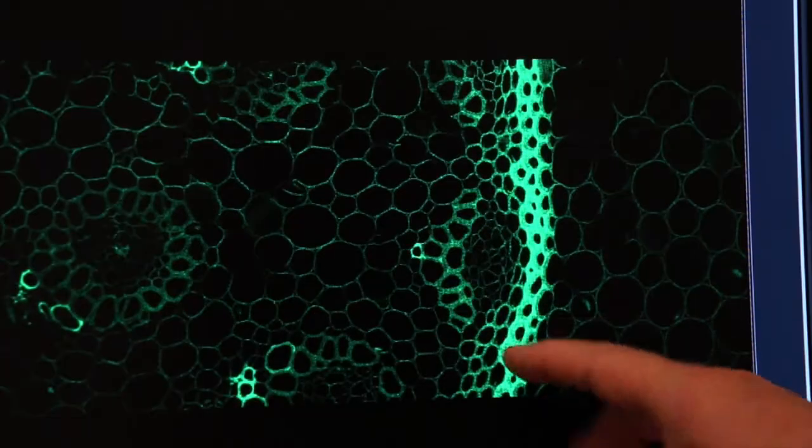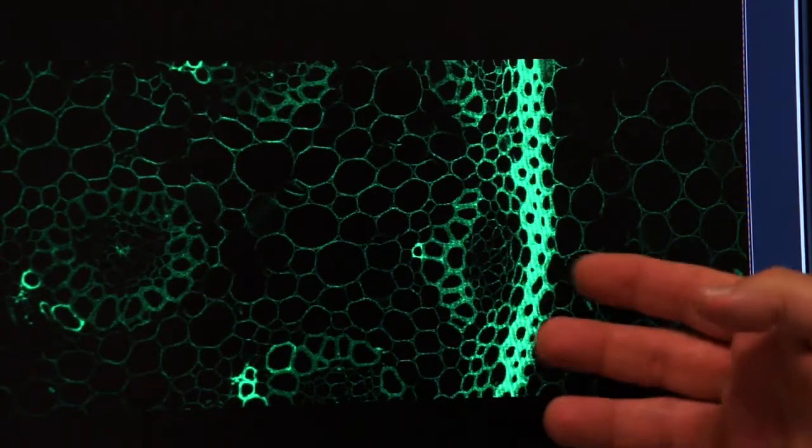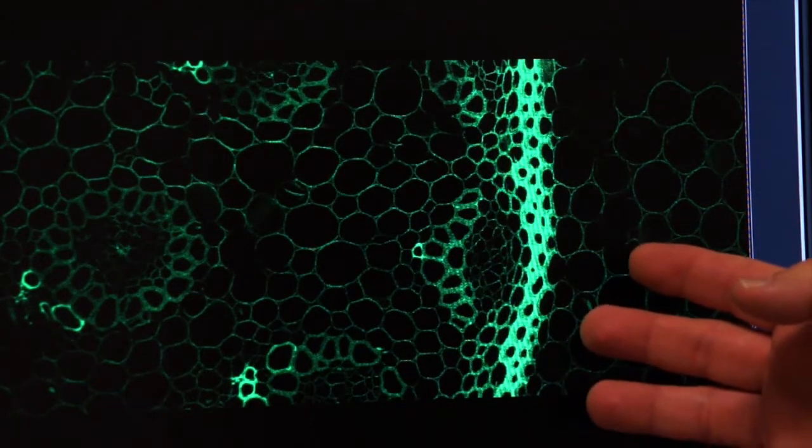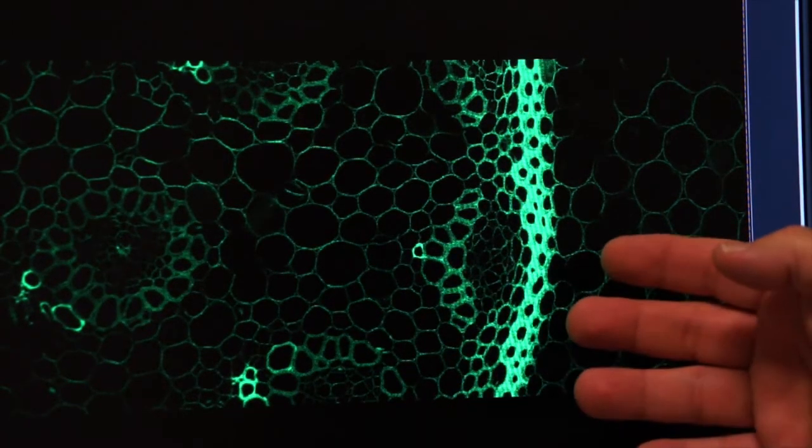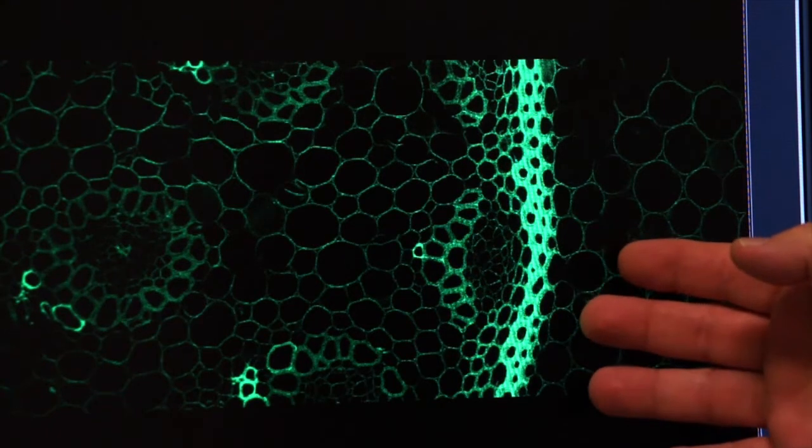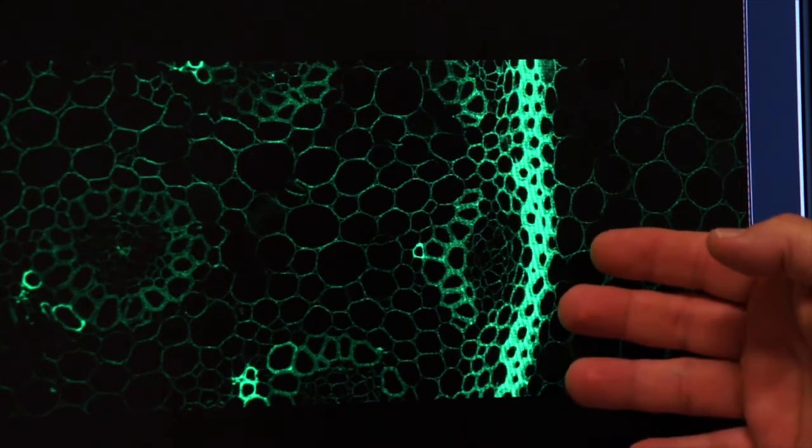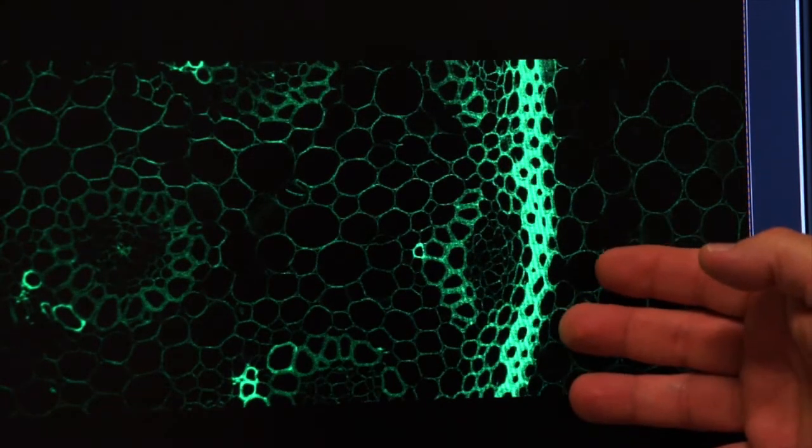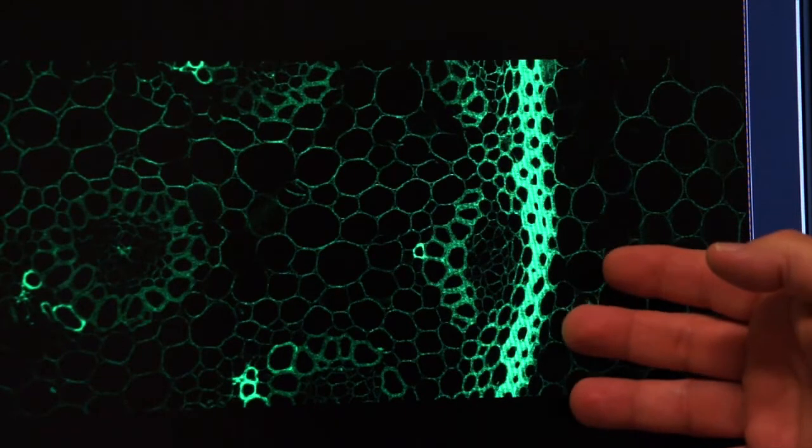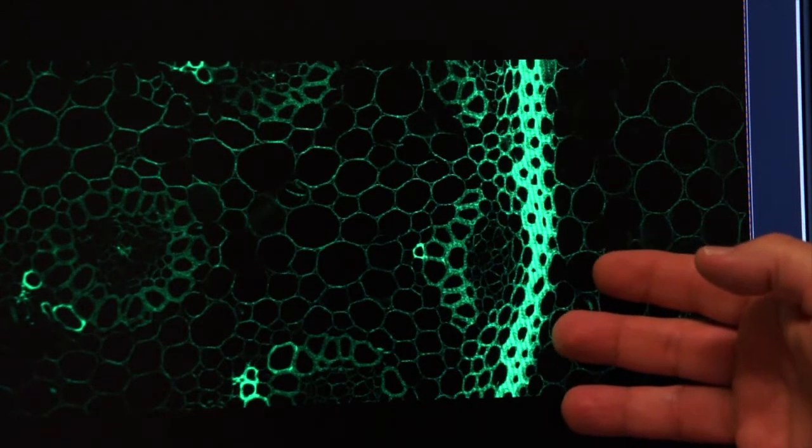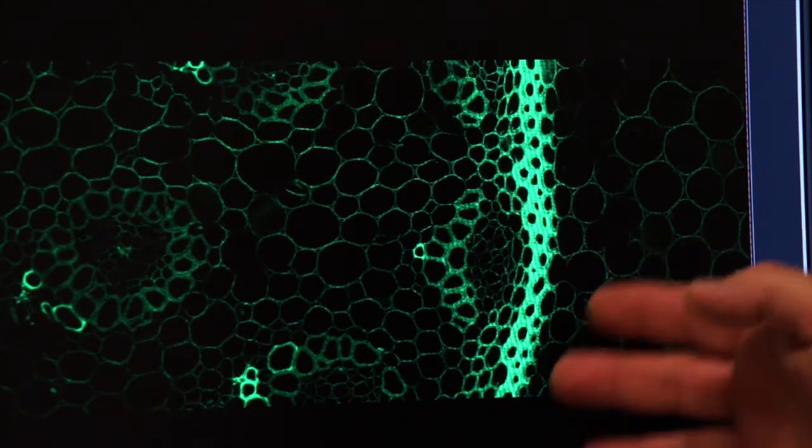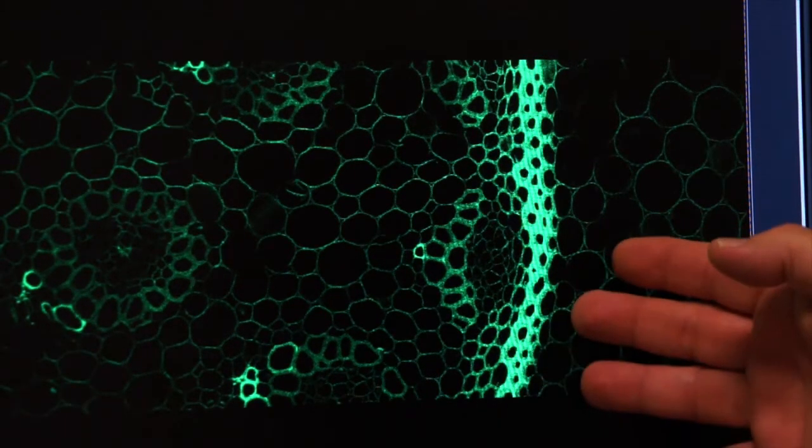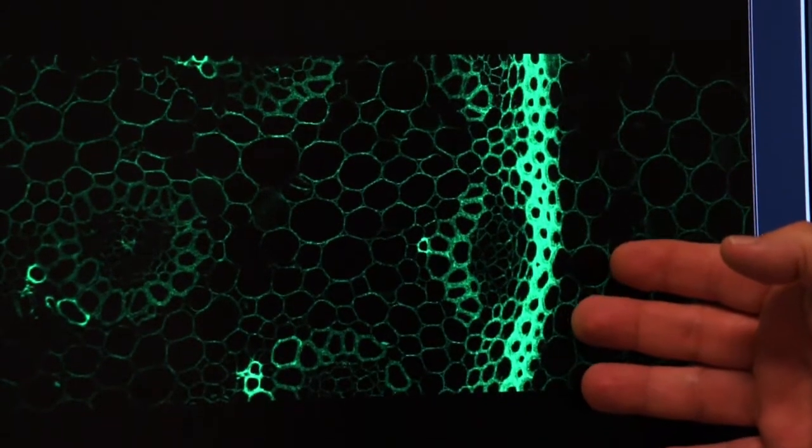Now, in this particular specimen, we're only doing autofluorescence. There's no fluorophore been incubated or attached to this tissue. It's merely reacting to the laser light that is hitting it. And so in this sense, there's no cause for worry about photobleaching.